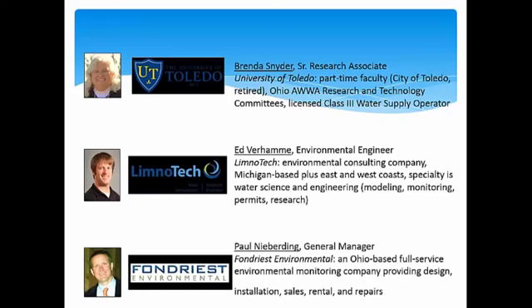If we look at turbidity during the bloom, the only thing that really contributes to turbidity during the bloom is the bloom, so the turbidity tracks the bloom. Now that changes in the fall once you get wind-driven resuspension, and turbidity is driven by inorganic matter in the water, so you can't use turbidity anymore. Phycocyanin and chlorophyll are isolating for green stuff in the water, and that's what we're concerned about. So there might be periods when you can use those other parameters, but you really have to be careful on how you interpret them.